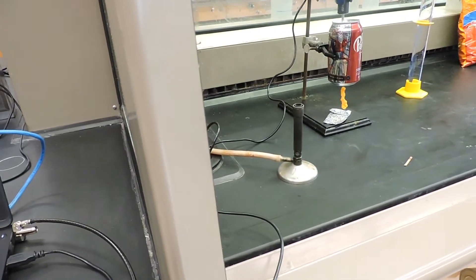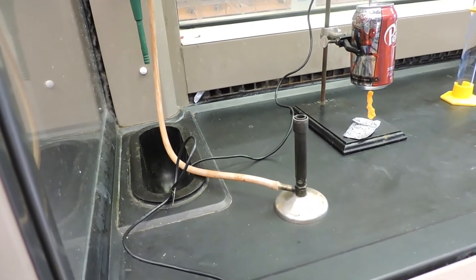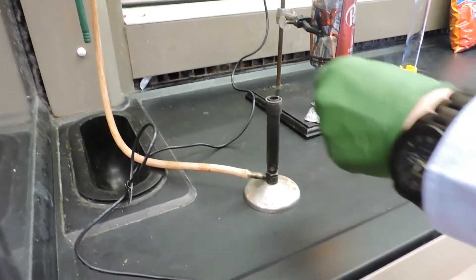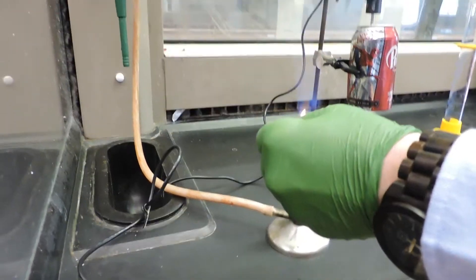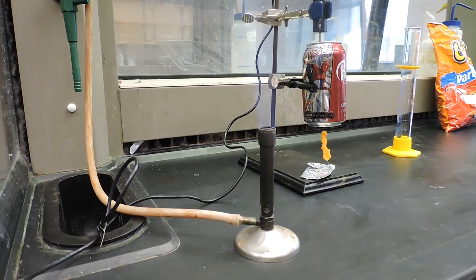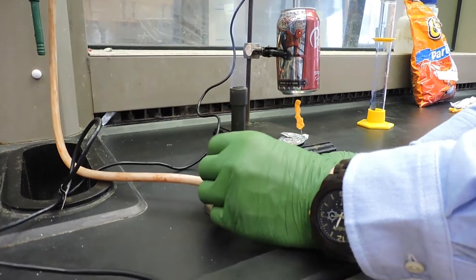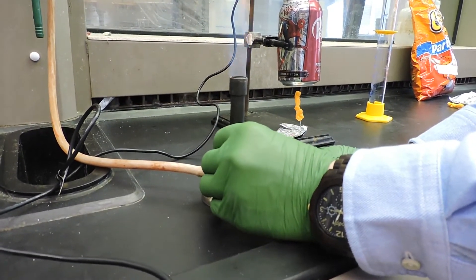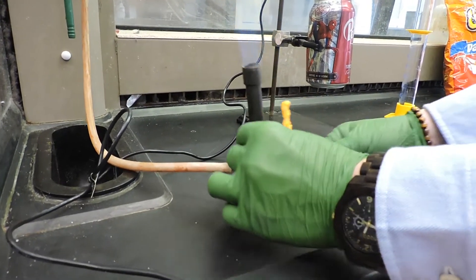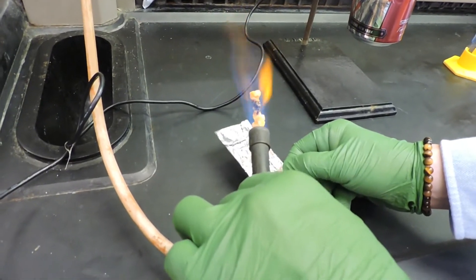Now, using a Bunsen burner, which Jared will ignite, you will set the Cheeto on fire and place it under the can. He's turning the Bunsen burner to make the flame a little smaller, and there it goes.